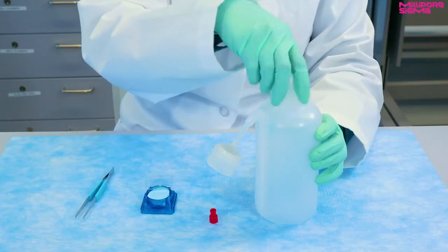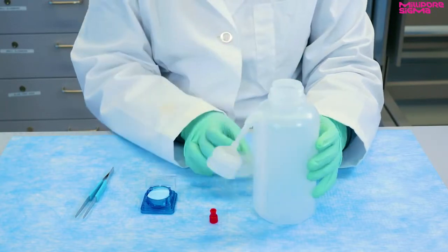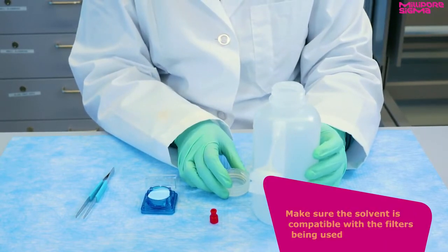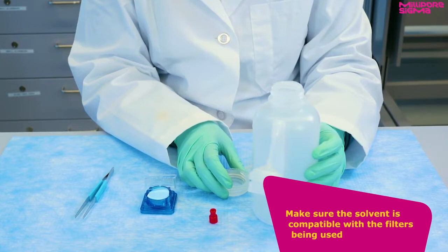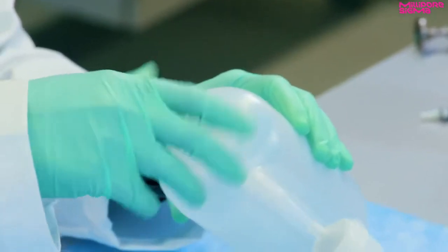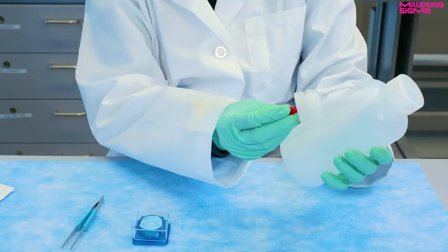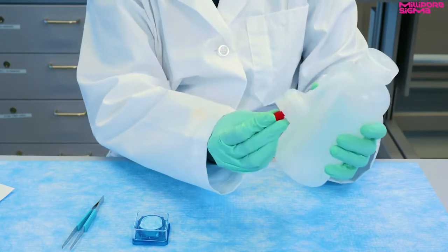Fill the wash bottle with the proper solvent for the hydraulic fluid as recommended by your method. Make sure the solvent is compatible with the filters being used. Replace the wash bottle cap. Insert the spout cap to prevent spillage when storing the wash bottle.